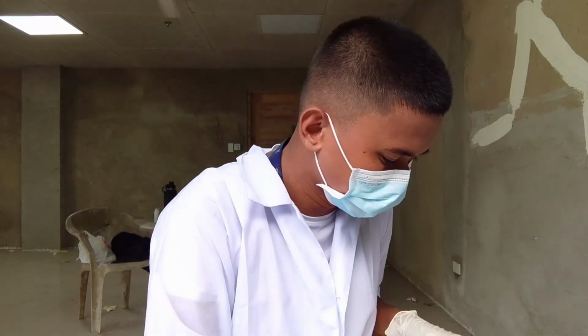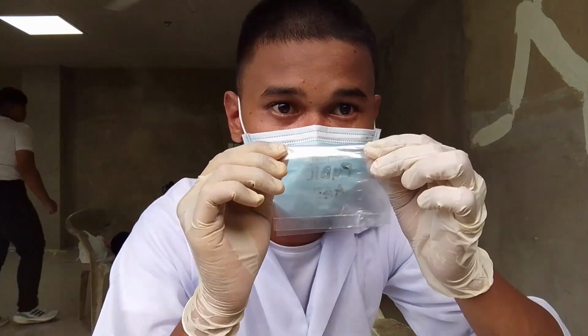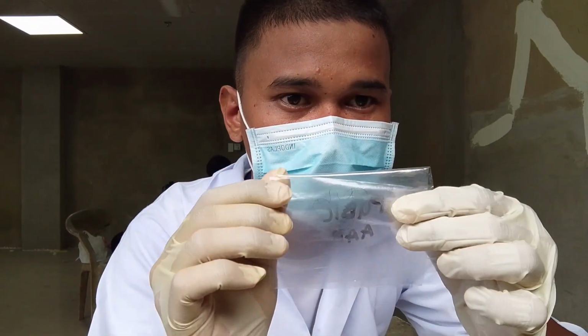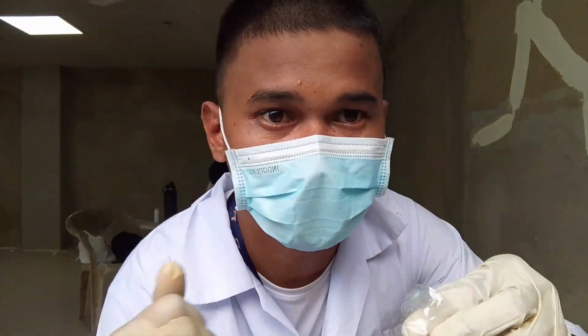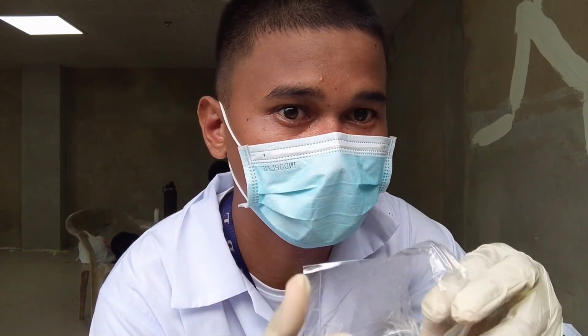I am done collecting the eyelash hair, so I will now proceed to the pubic hair. For the pubic hair, I have it here already. Before I proceed to the leg hair, I will first collect hair from the armpit.